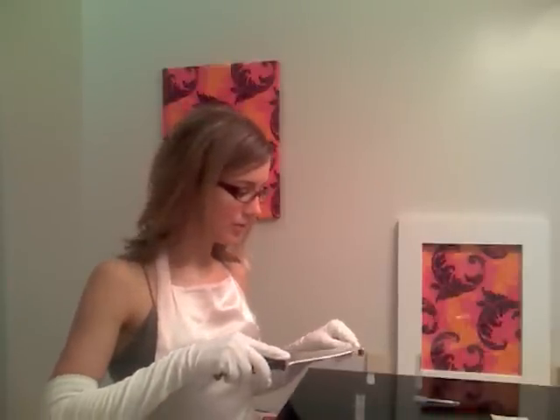Now that I've taken my sample, I'll need to mix it into the Gluten Extraction Solution. Now that the solution has been mixed for two minutes, I'll let it sit for another five.